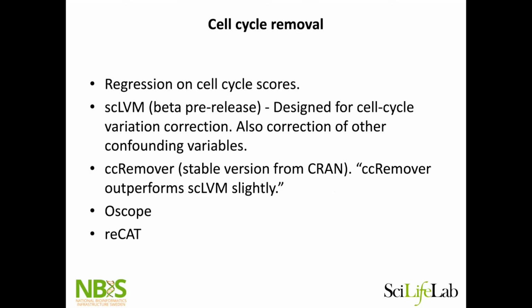So we get these scores. And then it's still just a prediction, of course. So you have to at least look at the scores, plot them, and see that they make sense in your data set. If it looks like everything is predicted to be S phase and that doesn't make sense given the data, you know that maybe it's not a good idea to take them and regress it out.